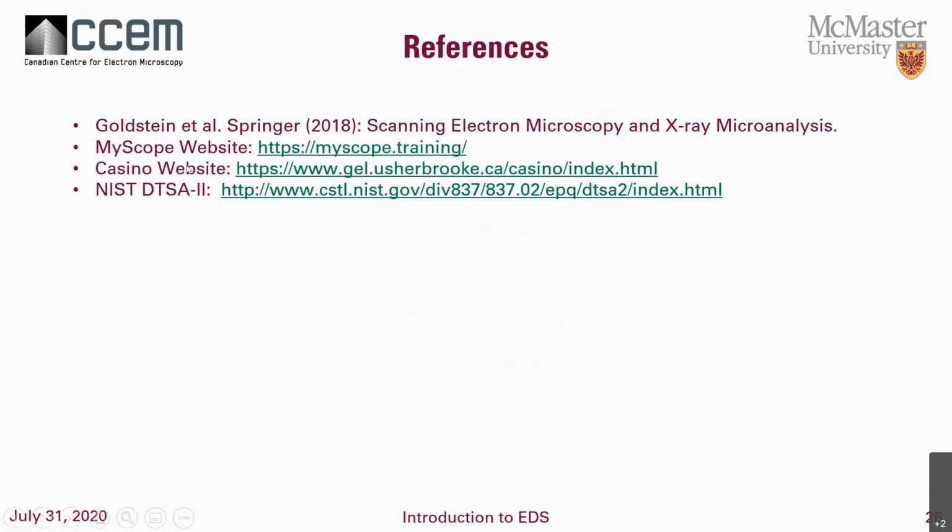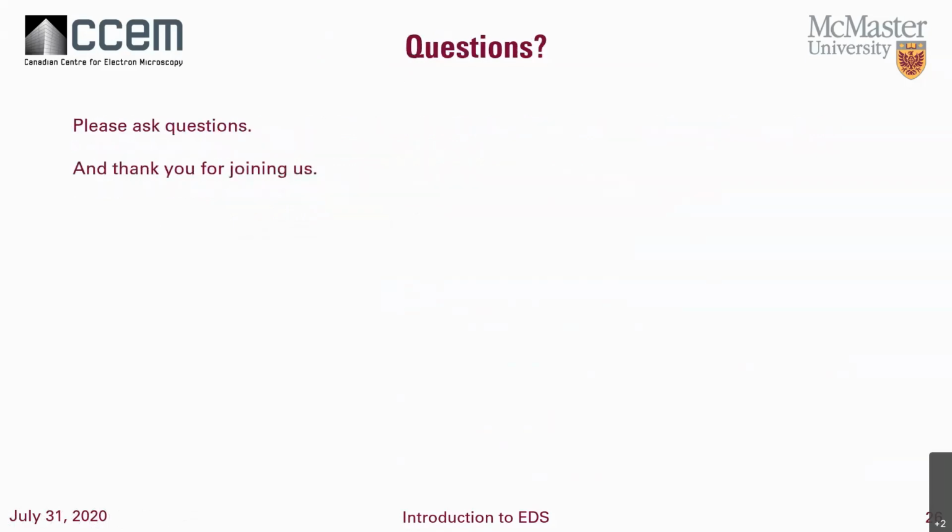So if you do want to actually do some calculations, NIST down in the States produces a program that's very useful. You may have to have some good information about the SEM and TEM before you can really make full utilization of the program. But it's very useful. Also, the people at NIST are very helpful for questions there.